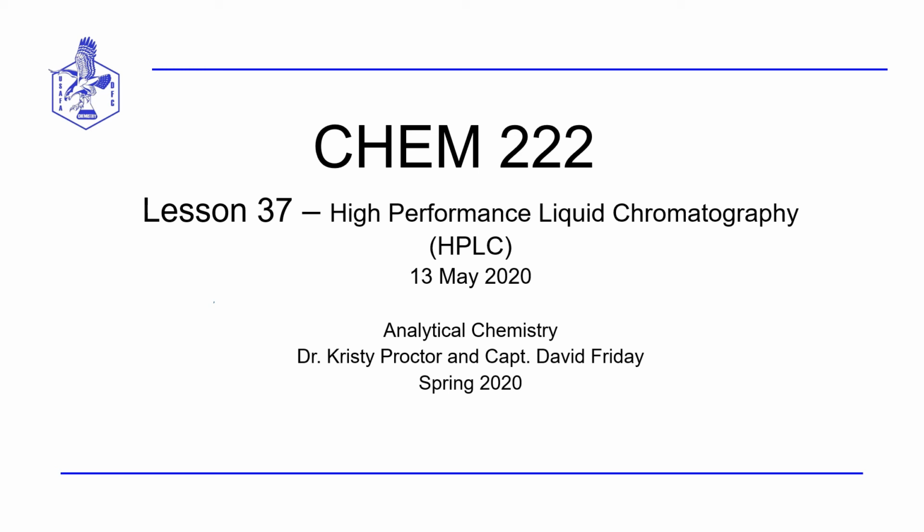Today we are going to learn a bit more about the technique of high-performance liquid chromatography.